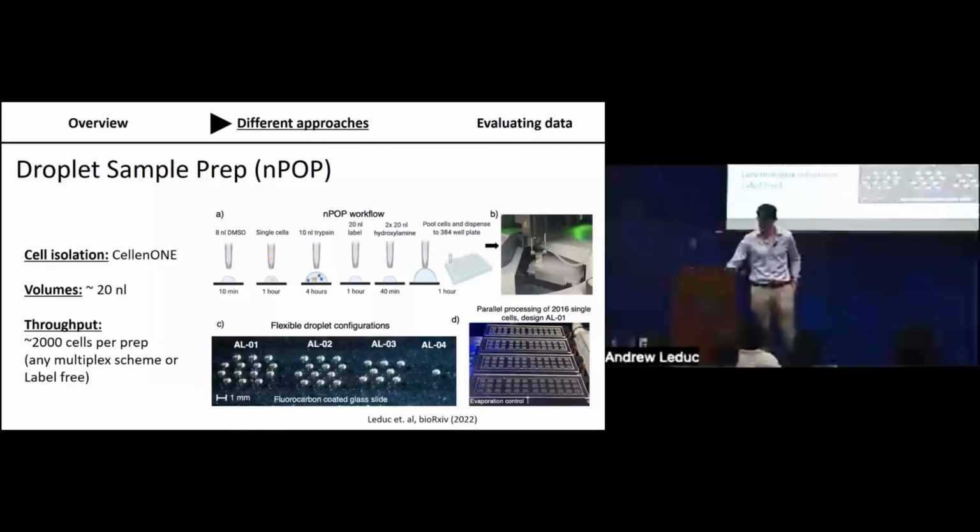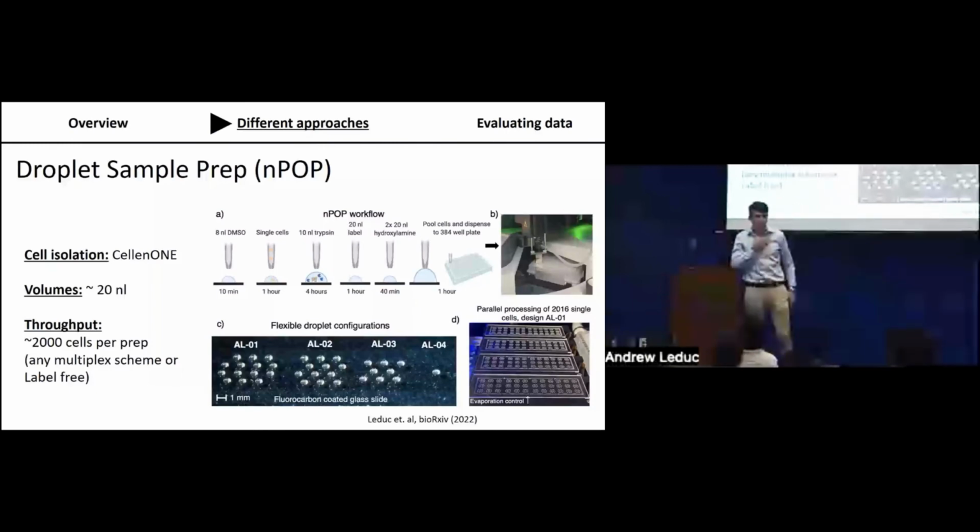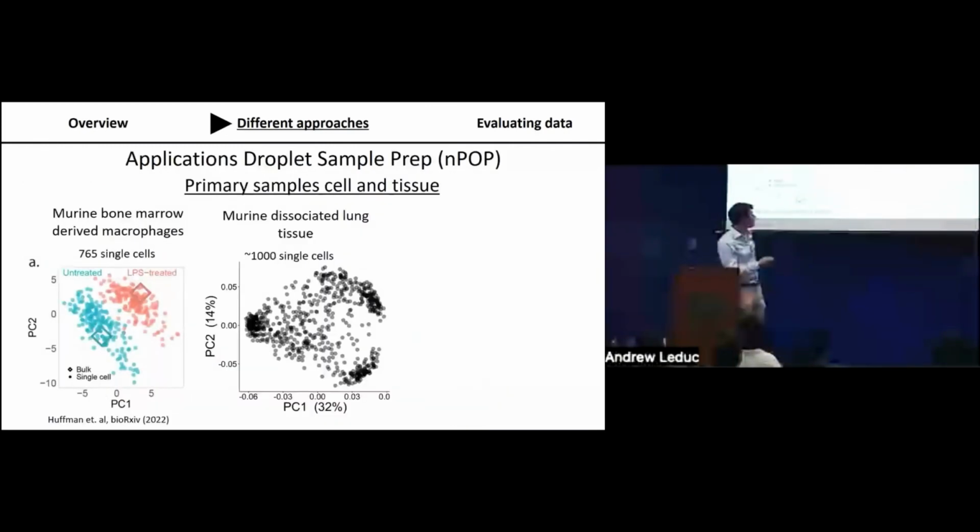But I just had a quick question to mirror off a few previous questions in terms of thinking about cell viability, especially within the sample prep process. At least for our lab, we've had long lab days trying to optimize. Can you comment on the steps from cell dispensing to trypsinizing, how to minimize cell loss and cell stress and maximize cell viability? Because I can think of a number of projects where that's really important between those two steps.